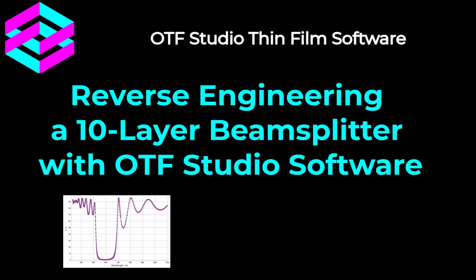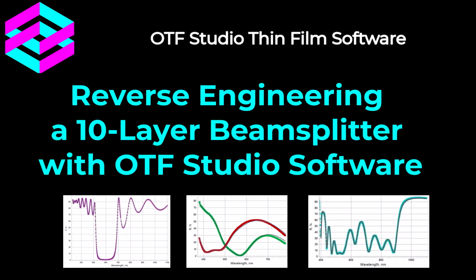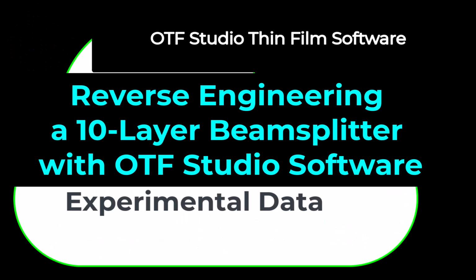Post-production optical characterization or reverse engineering of produced multilayers provides feedback to the deposition process. Reliable reverse engineering results enable adjustments of deposition parameters and finally improvement of production quality. In this video, I will demonstrate how to perform reverse engineering of a fabricated multilayer using OTF Studio thin film software.